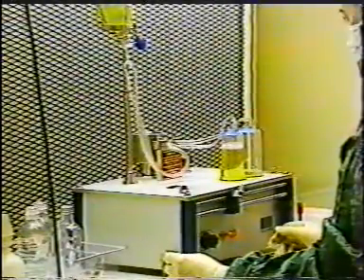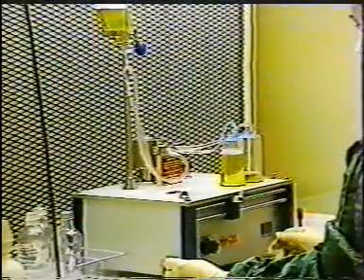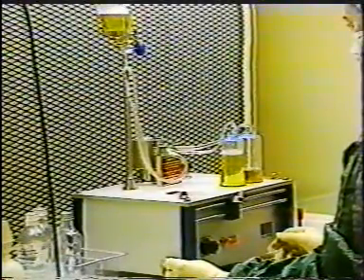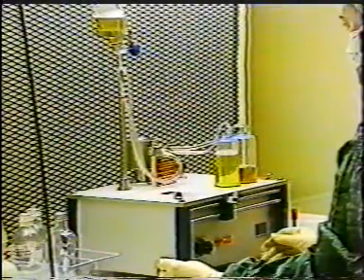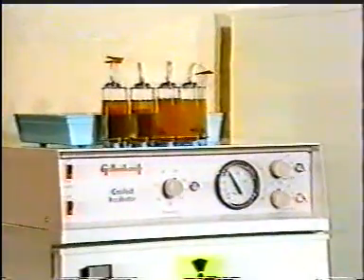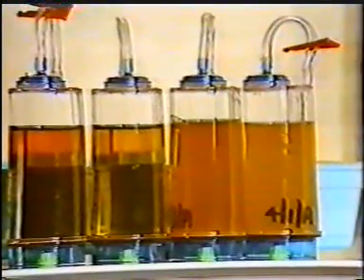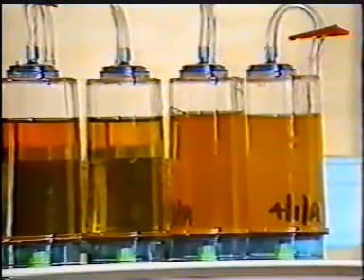When the filtration of the sample is complete, the outlet below the filter is capped and the growth media pumped into each of the chambers in turn. The chambers are then sealed and incubated for 7 days. Any microorganisms retained by the filter will multiply, causing the medium to turn cloudy. Where membrane filtration is not possible because of the nature of the sample, the alternative method is to inoculate media with aliquots of the sample and incubate for 14 days.